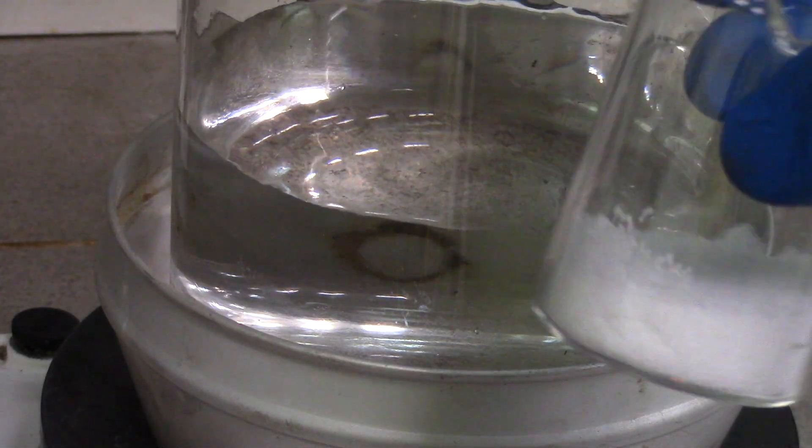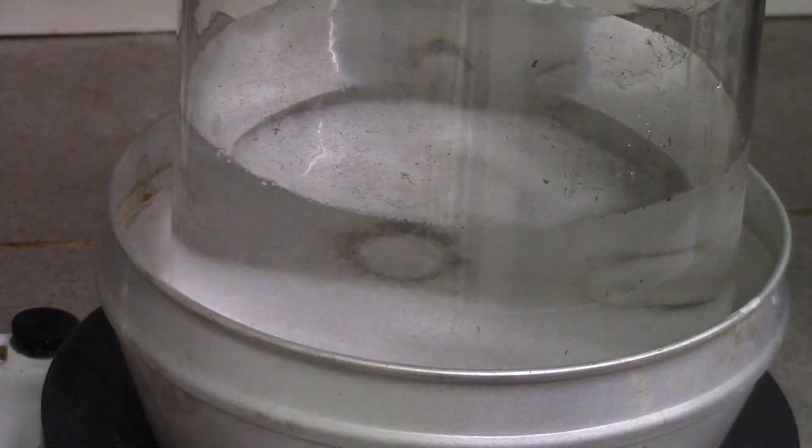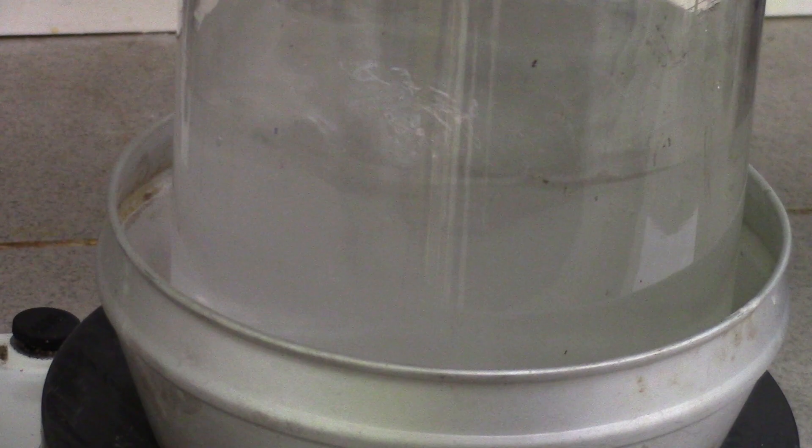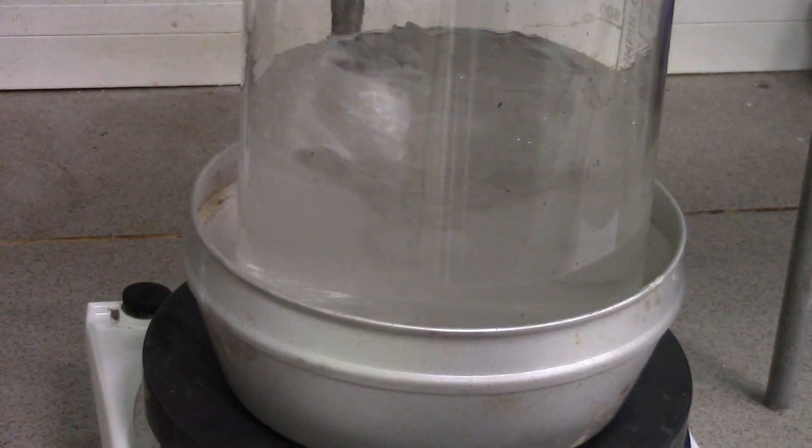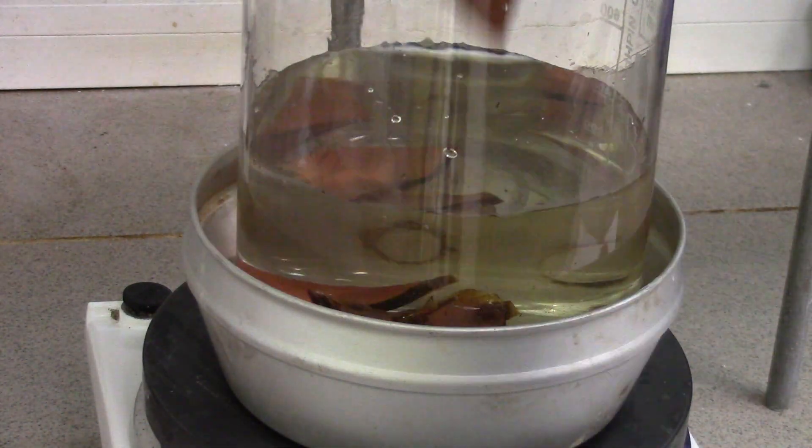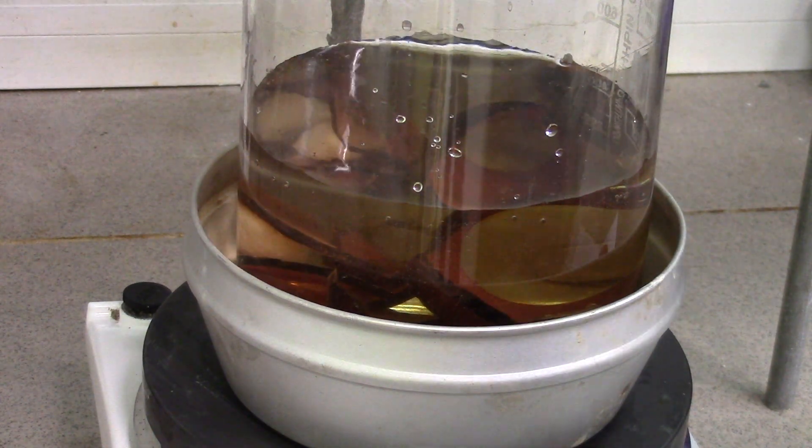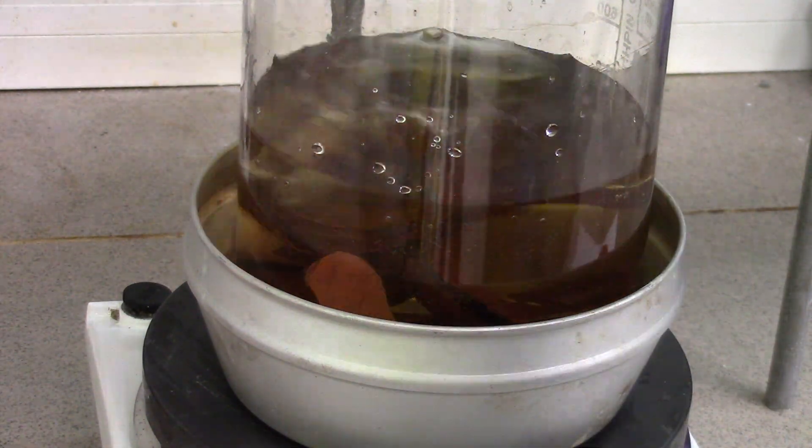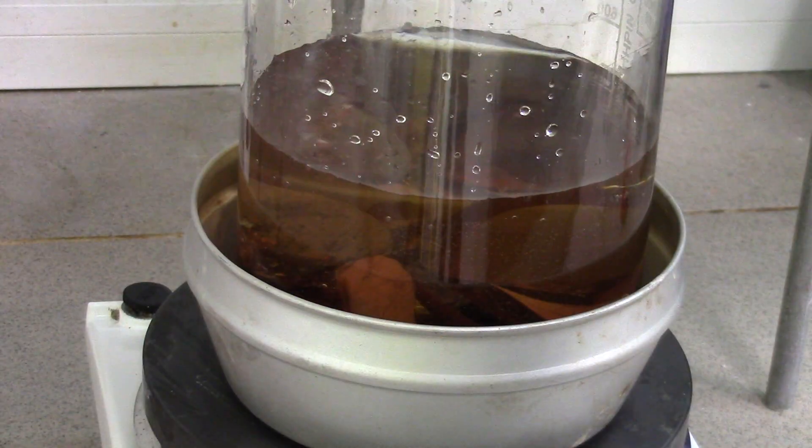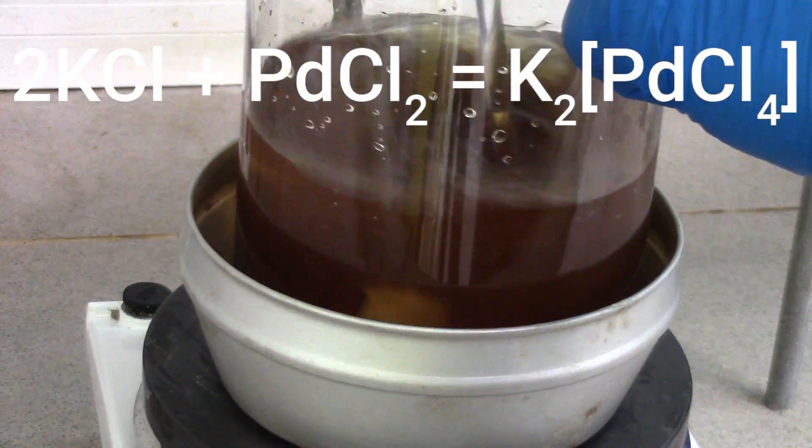I added 15 grams of potassium chloride and stirred it until it completely dissolved. Then I put all pieces of glass container into solution. As you can see, the solution instantly became yellow because of the reaction of potassium tetrachloropalladate formation.